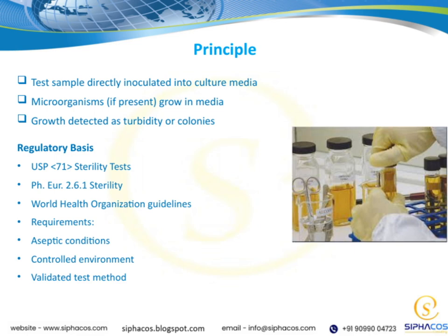Moving on to the regulatory basis, sterility testing is governed by established standards like USP 71 and Ph. Eur. 2.6.1. These guidelines ensure consistency and reliability across different laboratories. The World Health Organization also provides important guidelines in this area.